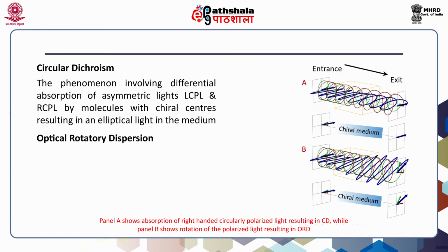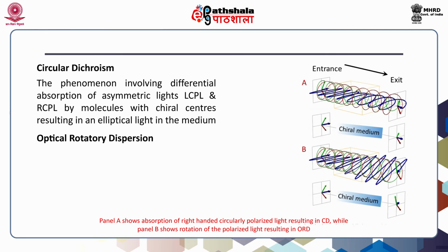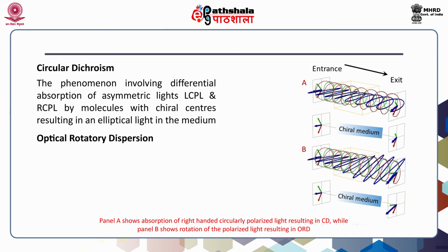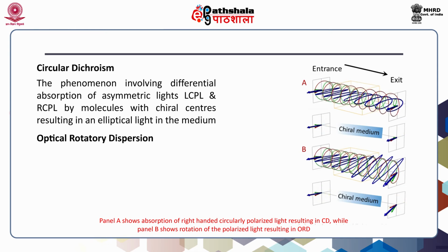Now you can see a box with light orange color placed between the left and right windows on the top panel. It contains the optically active medium. Observe how LCPL, the left part, and RCPL, the right circularly polarized light, are propagate when they enter the medium.